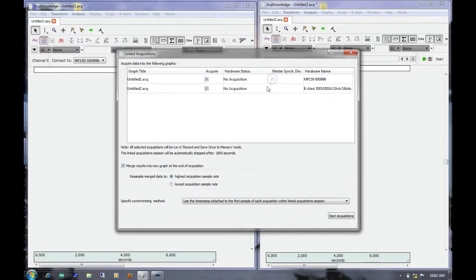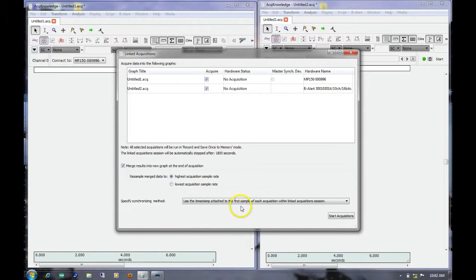We're going to use the MP150 as a master sync device. To do this, we go down to the drop-down menu where we can specify the synchronizing method. There are three options available. The window defaults to use the timestamp attached to the first sample of each acquisition within the linked acquisition session. What this means is that the system will look for the first timestamp from each graph window, find which timestamp is the latest of the two, and get rid of any data from before the first timestamp of the later device.